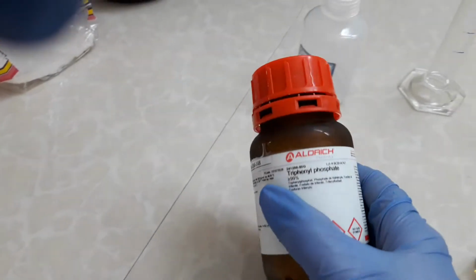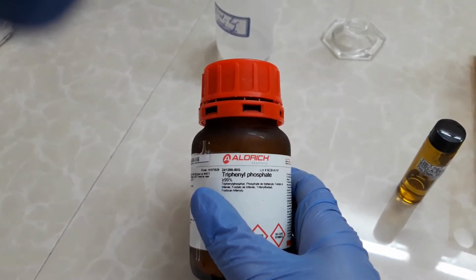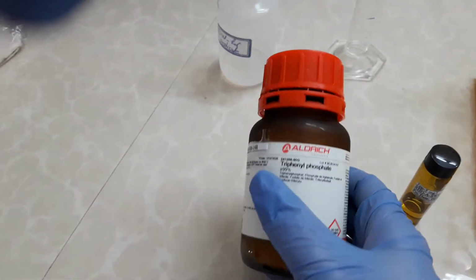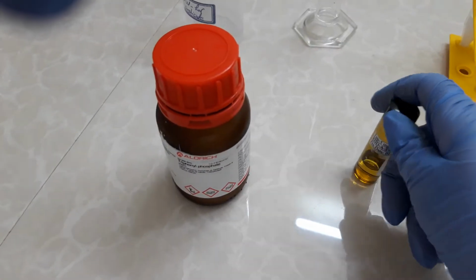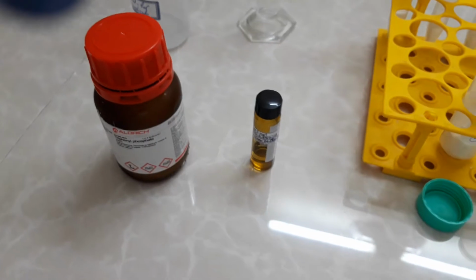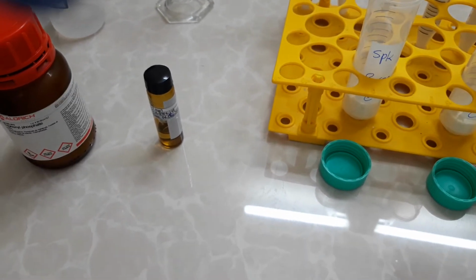Okay, this is triphenyl phosphate, which is used as the internal standard. In the first step, after spiking the sample, if you need to do this step, we make a solution of this internal standard with a concentration of 5 milligrams per liter. We can add this internal standard to your sample.